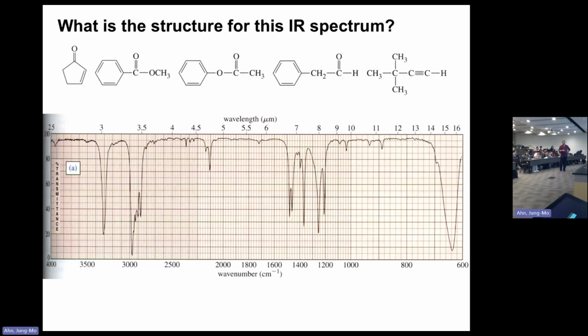And the triple bonded carbon has a hydrogen. So not this, not that, because all of these have a carbonyl. This is the only one without the carbonyl, having a triple bond and a hydrogen there. So we can say that this spectrum belongs to this molecule. This is the kind of thing you're going to do. Basically this is what I described, same thing.